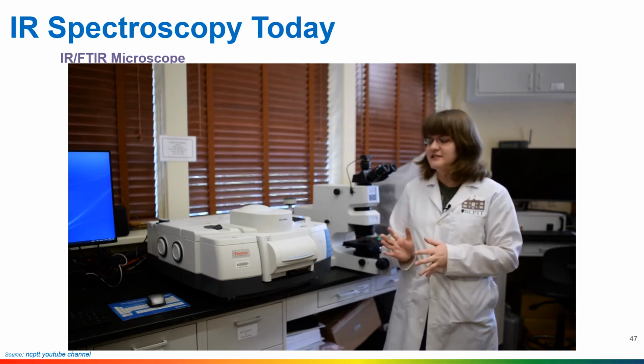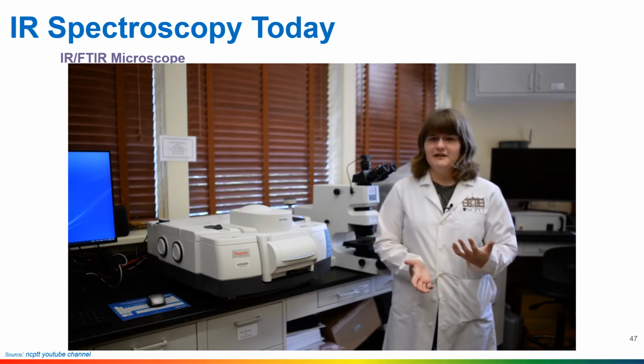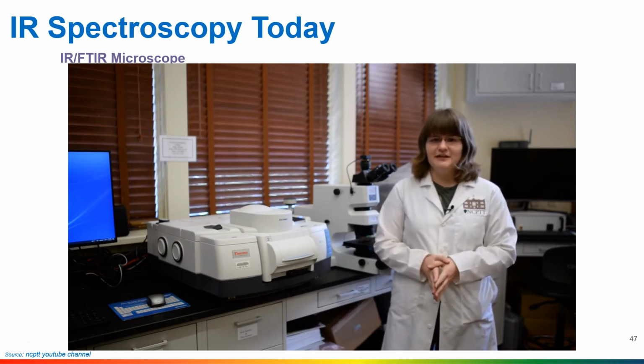So we can use this instrument for a lot of different techniques in our lab. So we can look for identifying unknown compounds or materials, as well as surface contaminants, or we can look for how deeply these chemicals penetrate into the substrate itself.